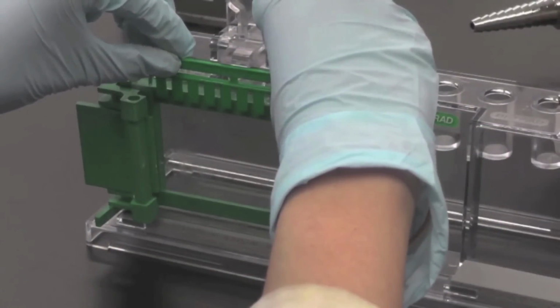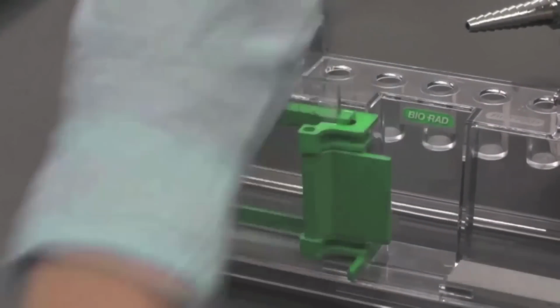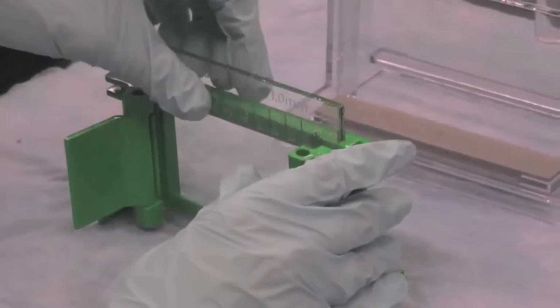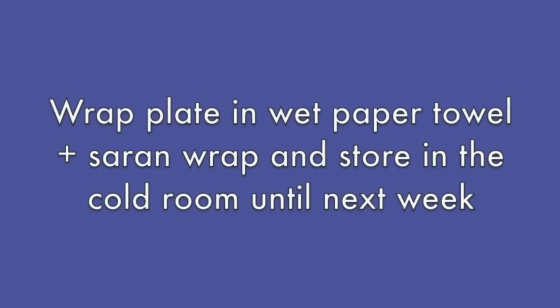After the gel is formed, unclip the casting frame with the gels from the casting stand. Then carefully remove the glass plates from the casting frame. Wrap the plates carefully in wet paper towel and saran wrap, then store in the cold room until next week.